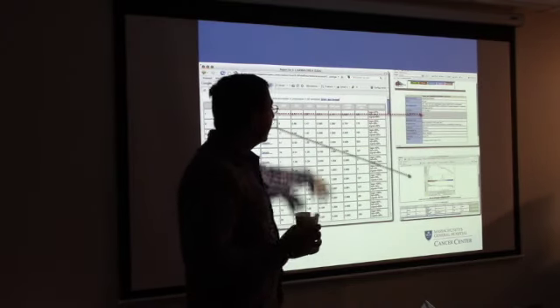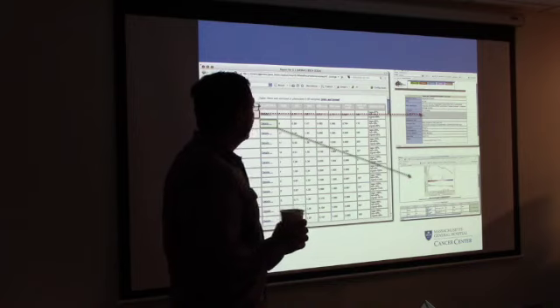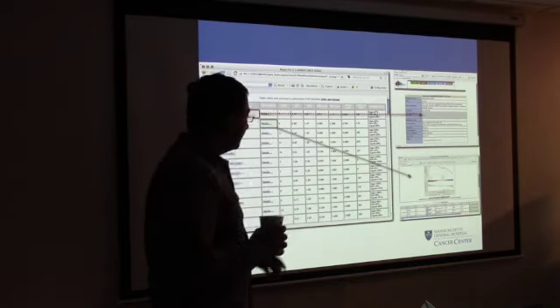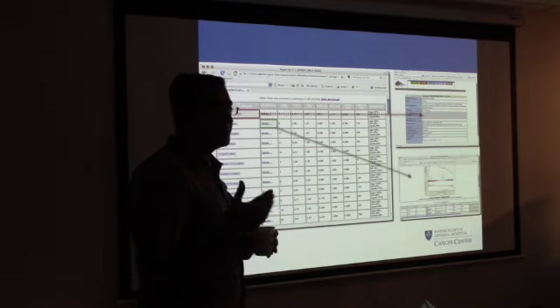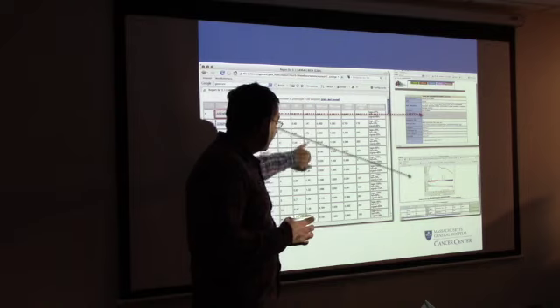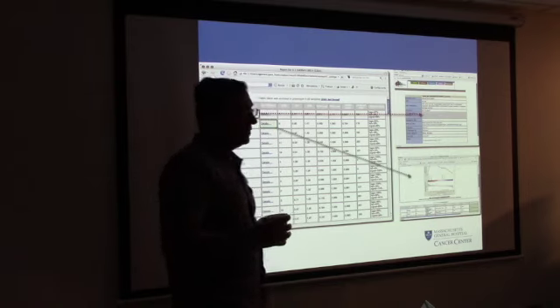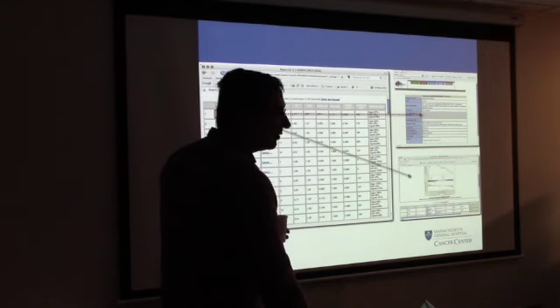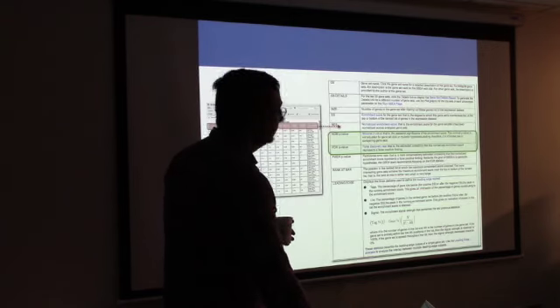And then it gives you the rank at the maximum. I would look at your normalized enrichment score and then go from there. That's the first statistic that I would look at. And usually they're ranked by the normalized enrichment score in descending order. So that's a good thing. You can start from the topmost and go from there. Okay?